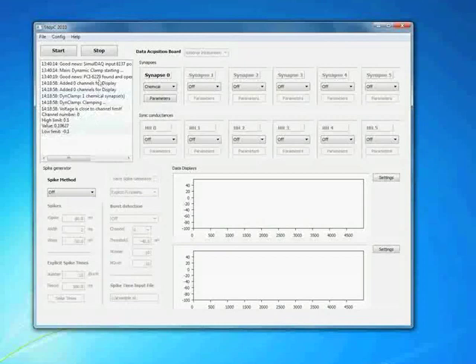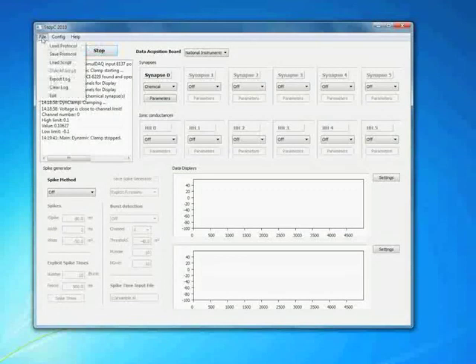Once you're done with clamping, you just hit the stop button, and that completes the clamping and the writing of the data to files. After this, you can do offline analysis of your data separately, and you can close StdpC by just choosing File, Exit. Before you do so, you might want to consider to save your protocol, which is to save the settings we did in this video, so you can use it next time you use dynamic clamp, just using the load protocol function. The other items in here are for loading and unloading scripts.